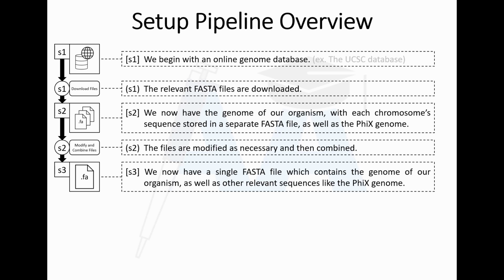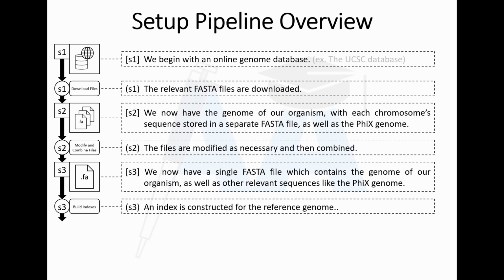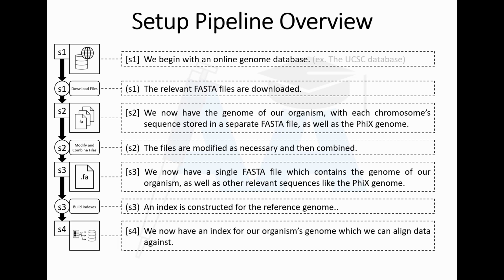Using this file, we construct an index. We now have an index for our organism's genome which we can align our data against. Let us go into a bit more detail.